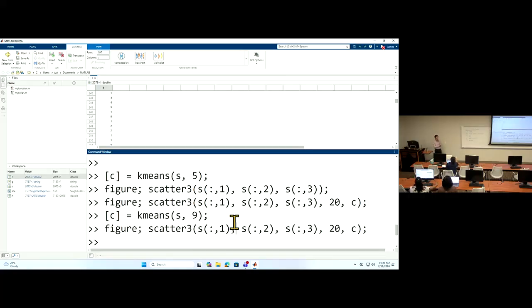Further clustering will be done before cell annotation. Cell annotation will annotate each subgroup you clustered here. You can have different cell types. If cluster 1 is T cell, cluster 2 is T cell, then you merge the two. If they have different names, then you do not merge them, you keep the original clusters.